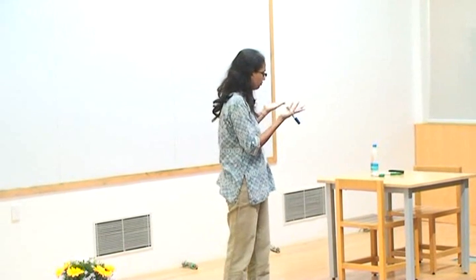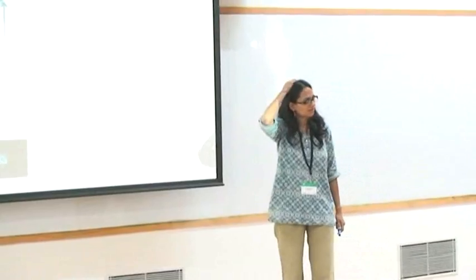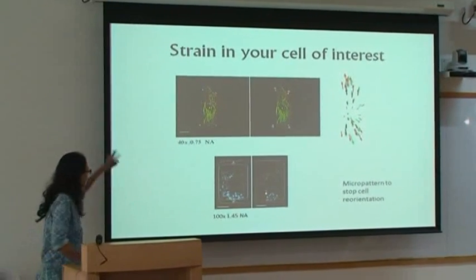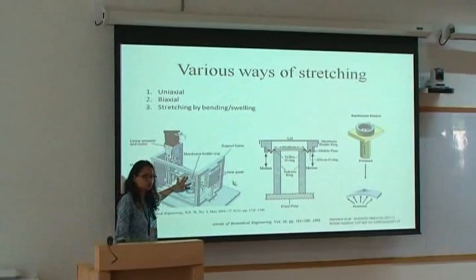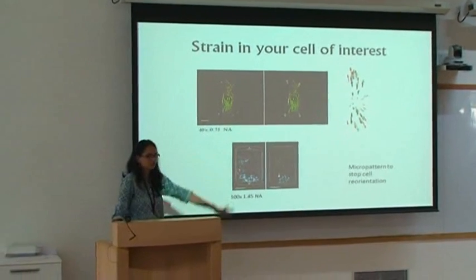So what we did yesterday was really a hands-on thing. But when you do it for an experiment, you have to be clean. It depends on what kind of imaging you want. If you want to do something like this, it's advisable to have cleaner environments. You don't want to polymerize dust. This is from a paper whose reference I forgot to put there, and I think it's really nice if you're happy with this kind of imaging.